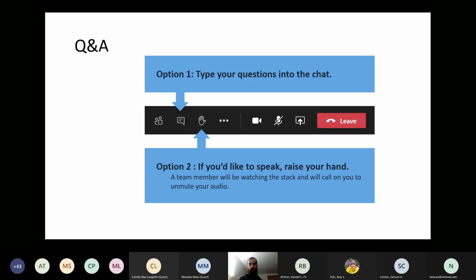Yeah, I'm sorry that's a little bit of a wishy-washy answer, but I'd be interested in talking to other folks who have direct experience working with the MiSeq and how much they've messed with custom bioinformatics to deal with the higher error rates.